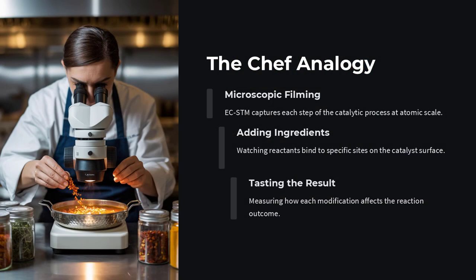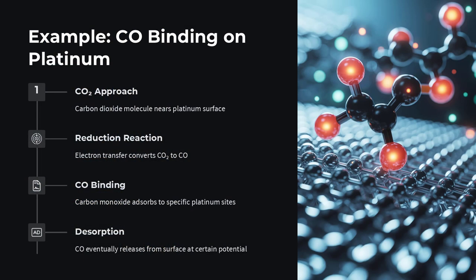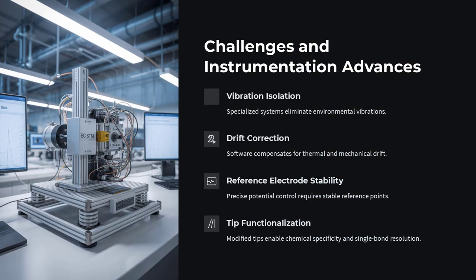The resolution and stability required for imaging in liquid is extremely high. Vibrations, noise, and molecular motion can make interpretation tricky. Additionally, STM only works for conductive or semiconductive surfaces, limiting the types of samples that can be studied. Nevertheless, continuous advances in tip functionalization, feedback control, and machine learning algorithms for interpreting spectroscopy data are pushing the field forward rapidly. So where's this heading?